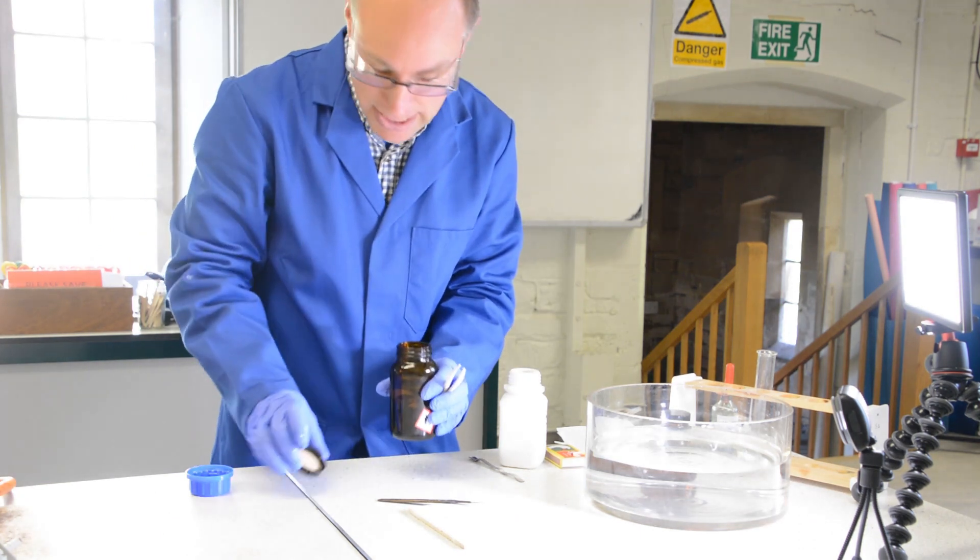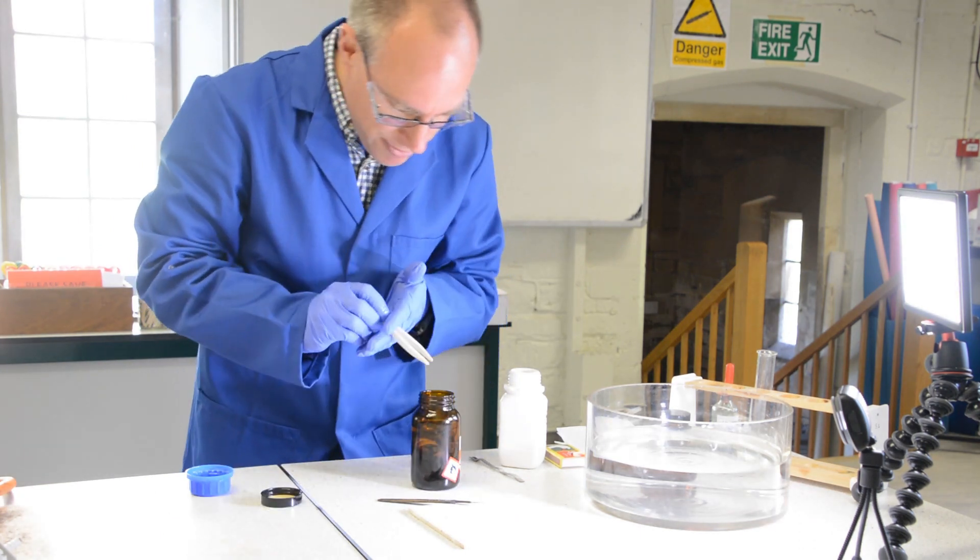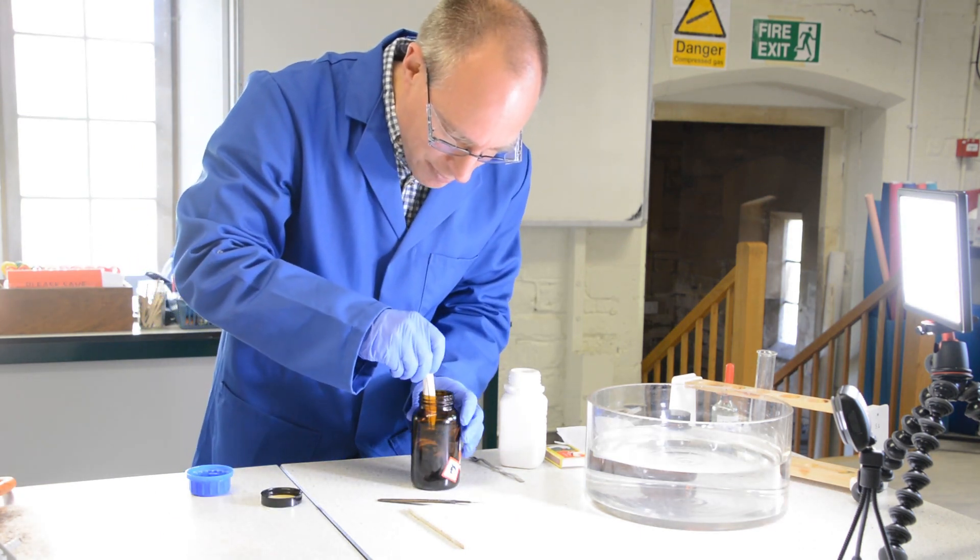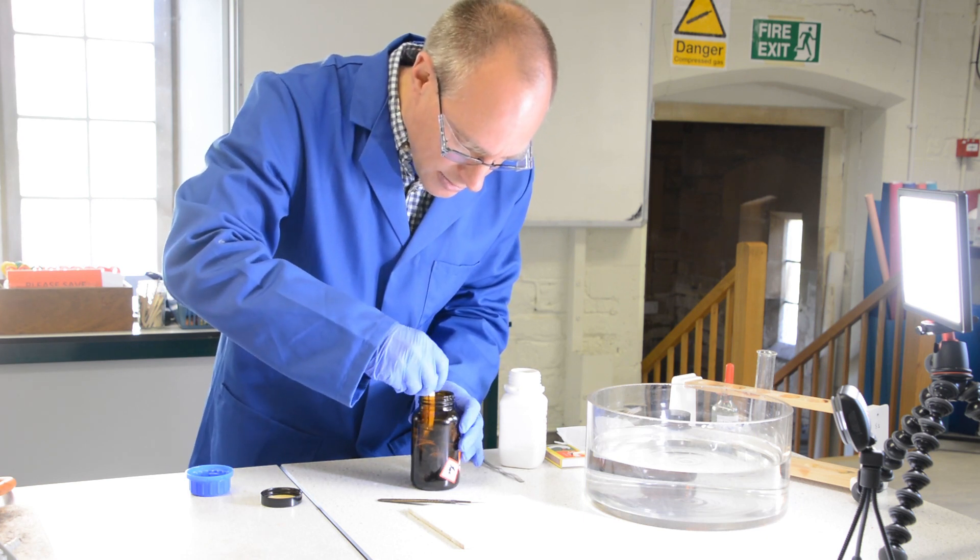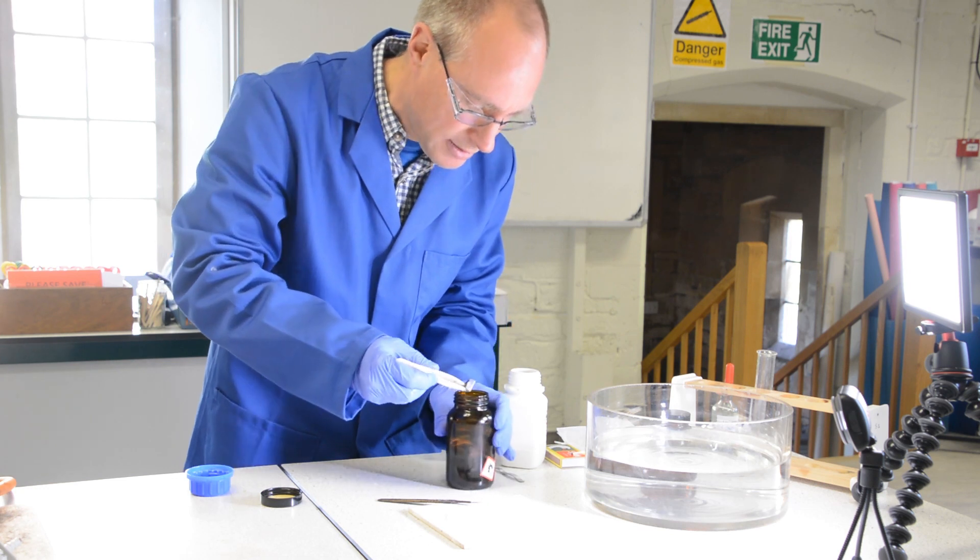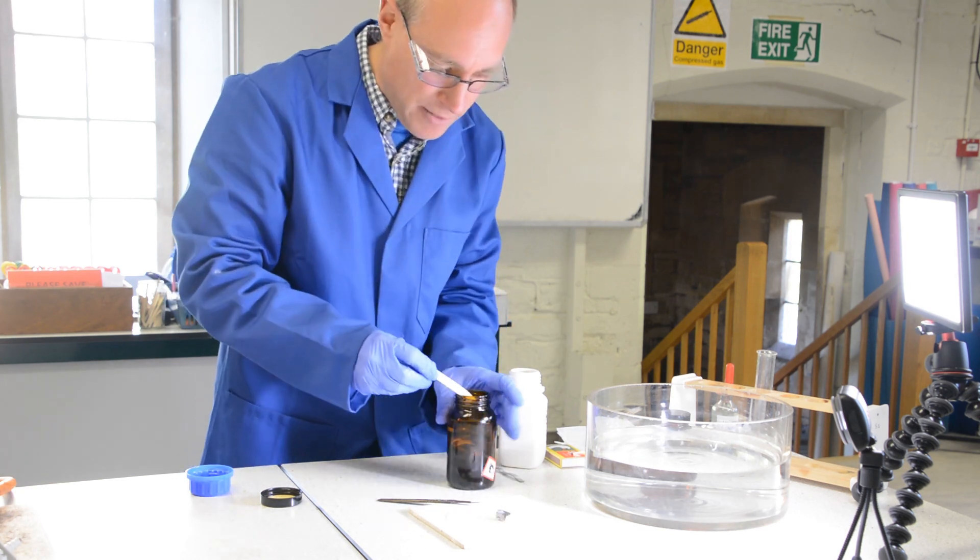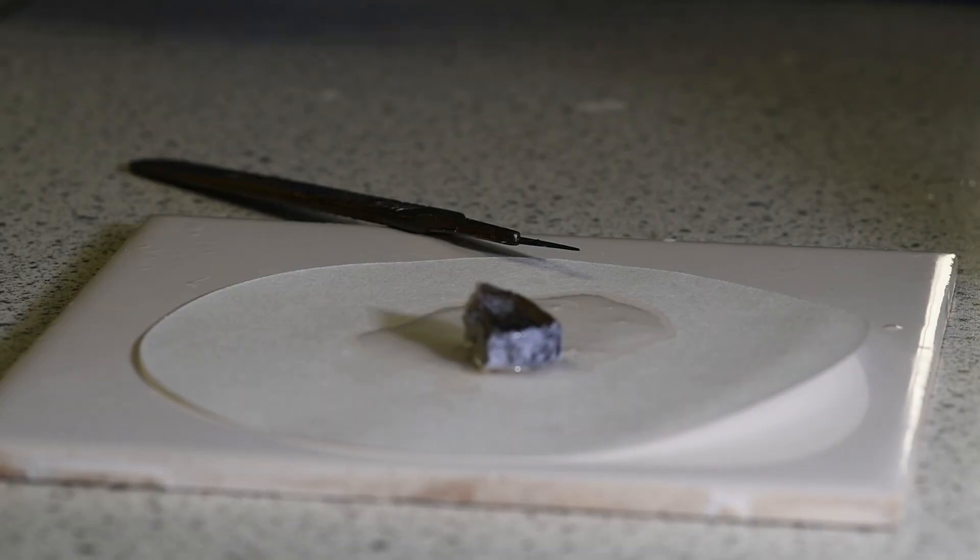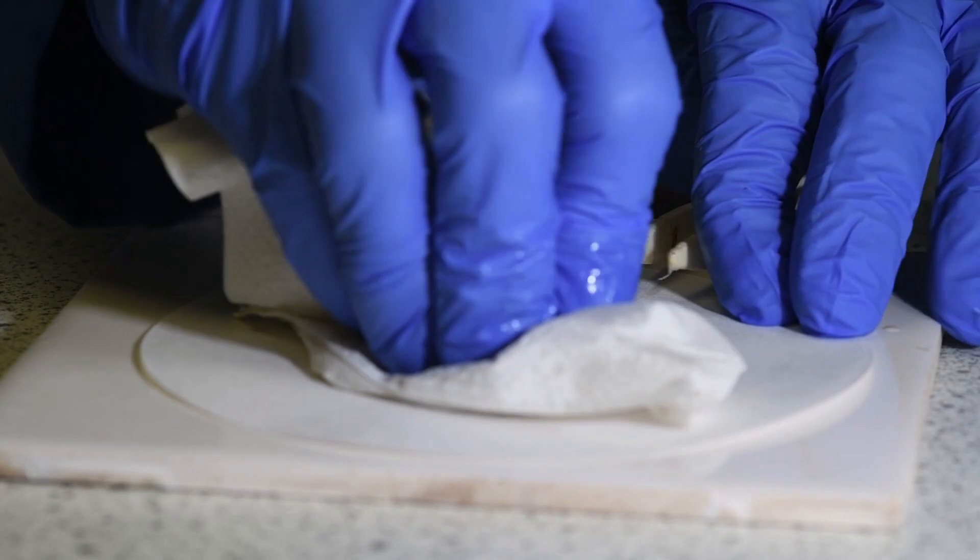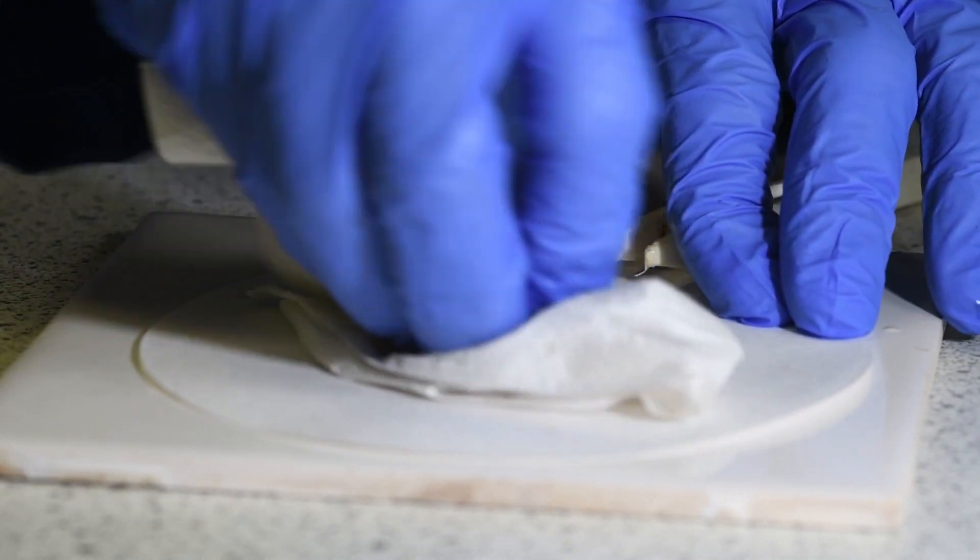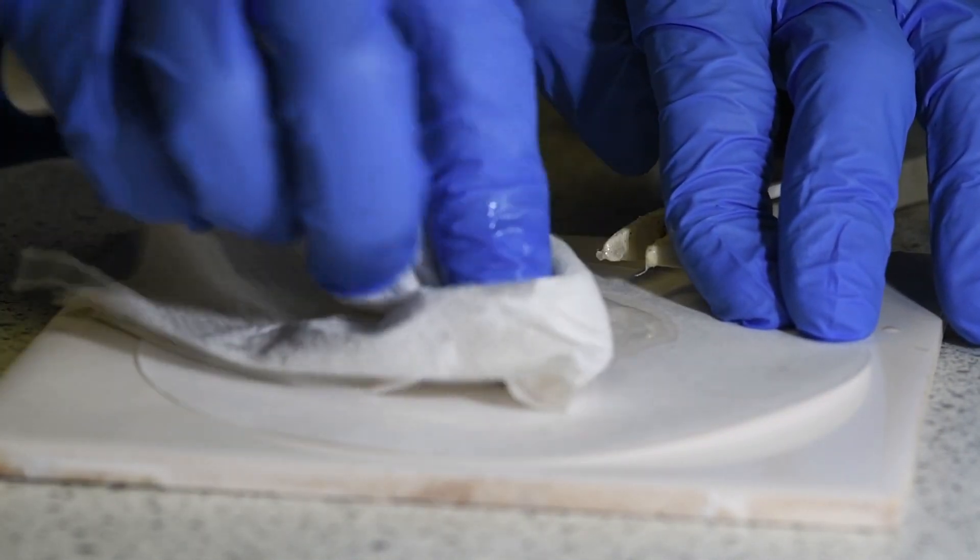And finally, potassium. Again, it's very rare that you get to see good sized pieces of potassium. So here is a piece of potassium and again covered in oil. I'll just dry some of that oil off that potassium.